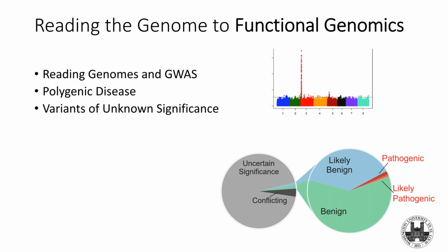So the majority of the variants out there right now in diseases that we're interested in, probably that you're interested in, are like this, where people may have a mutation in a gene that's known to be important, but we don't even know whether that mutation is functional. So what I care about, and what functional genomics is really about, is trying to figure out whether those variants are functional or not. When you change this position in a particular gene or even an intergenic region, wherever you want, does it change the cell or the organ or the patient?